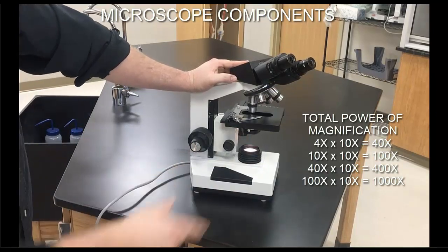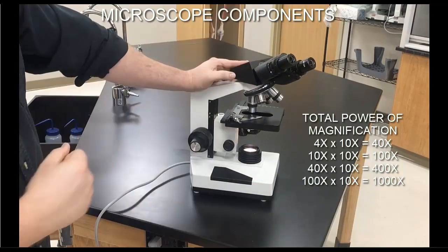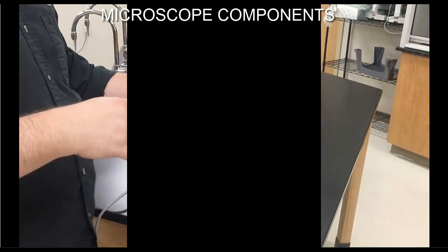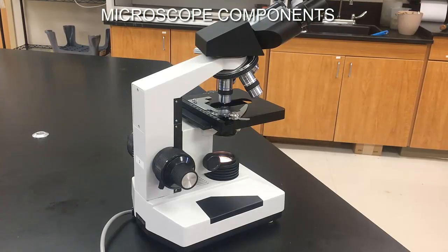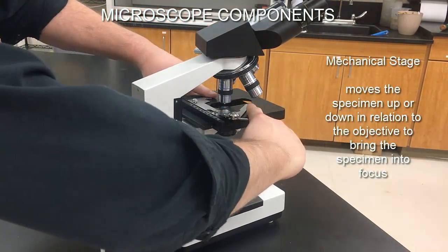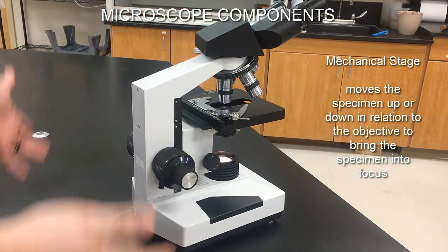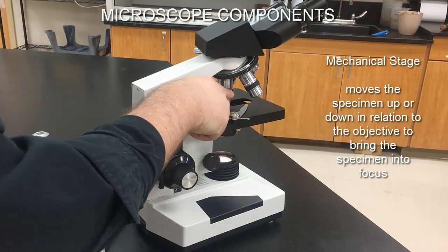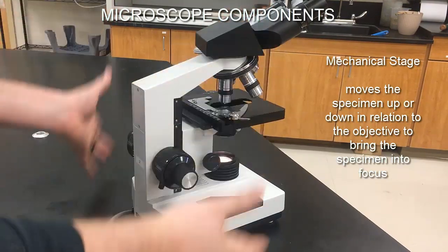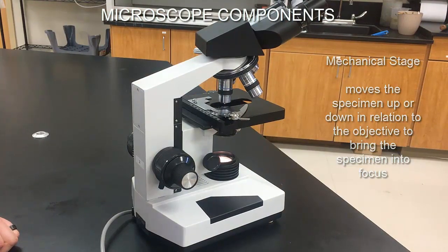All those magnification powers are based on having a 10x ocular. We can increase total power by using a higher power ocular. So those are the objectives. The next piece to identify is the mechanical stage — the flat piece in the middle. It moves the specimen up or down in relation to the objective to bring it into focus.